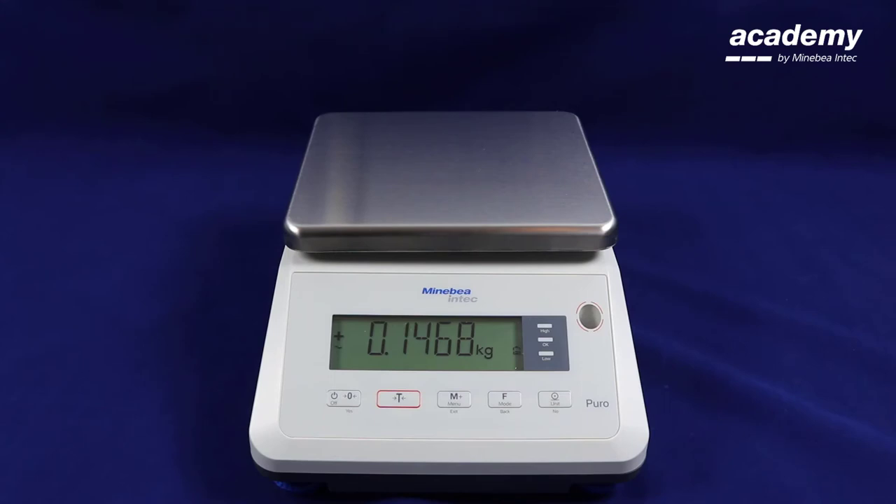When you remove your sample the weight will hold on the screen. To clear the weight you need to press the function key. This unlocks the scale.